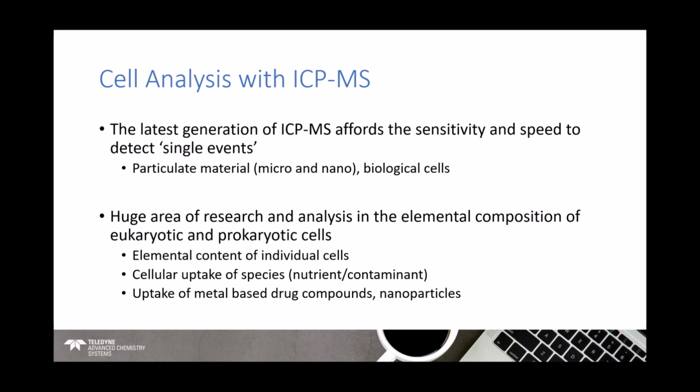Cells generally are a huge area of research in biological and clinical applications. They are studied these days for elemental composition, as well as all the other aspects of analysis that they're part of.